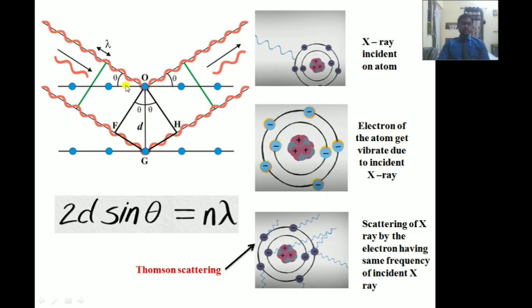So this entire mechanism is happening inside the crystal, and the angle of incidence also plays a very important role. At some particular angle, the incident beam gets scattered coherently with the first ray, second ray, third ray, fourth ray, and n numbers of rays. That means crest to crest and trough to trough get matched.